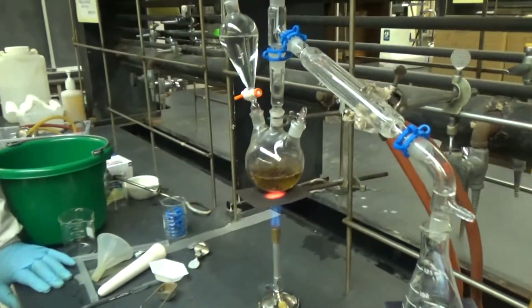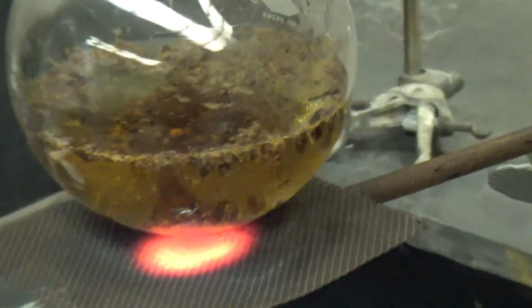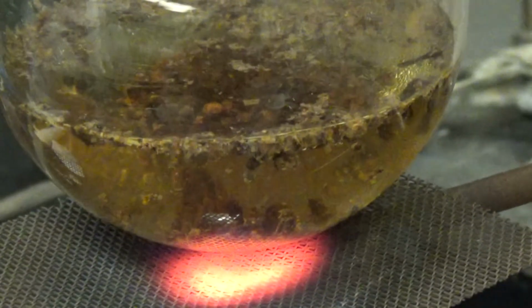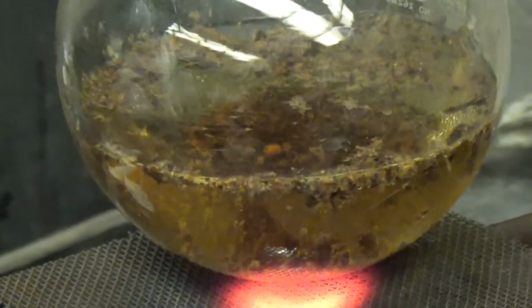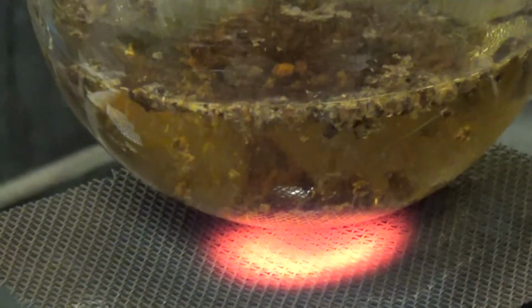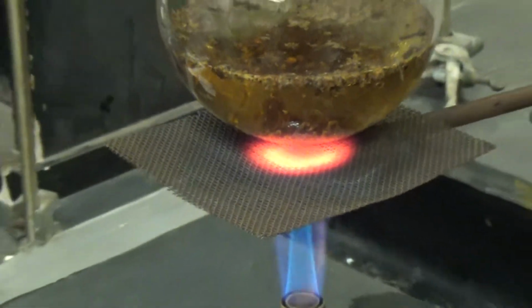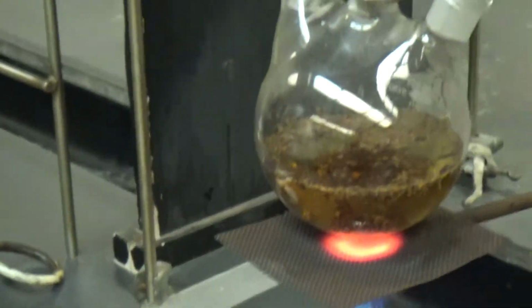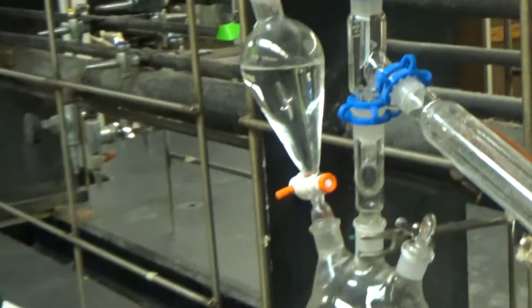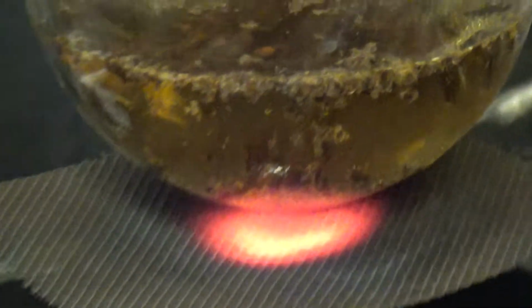All right, so we're a couple minutes in. It's heating up. The metal's getting really hot there. We're going to boil. Water is condensed and we are going to collect over there. We see some bubbles, so it's getting there. I'm gonna stick my hand in the fire and see how hot it is. It's hot. Don't do that. It's really hot. That's what the red means.